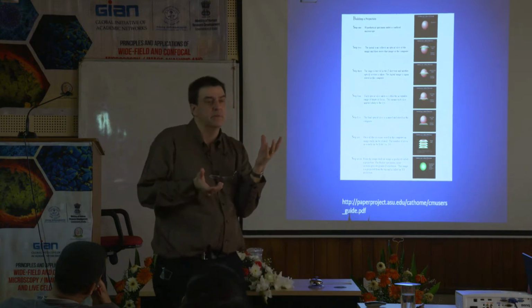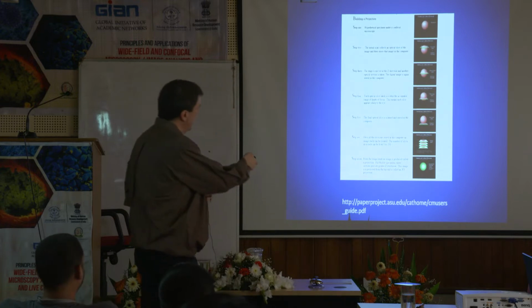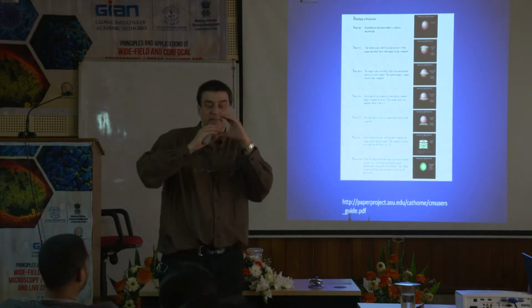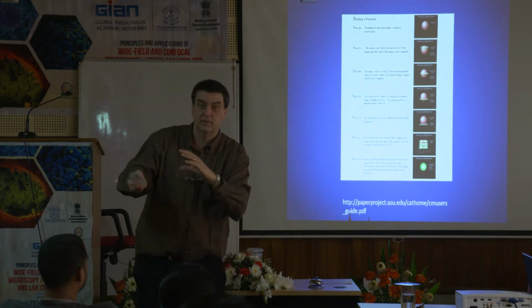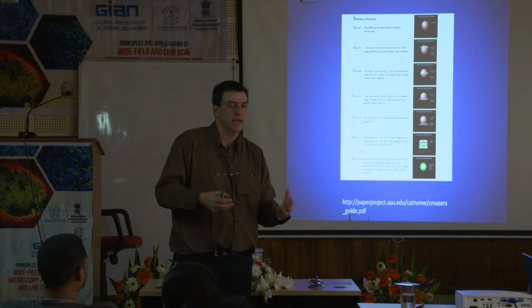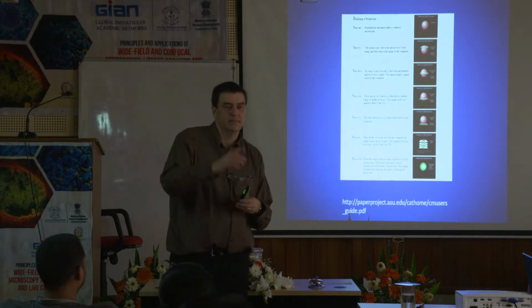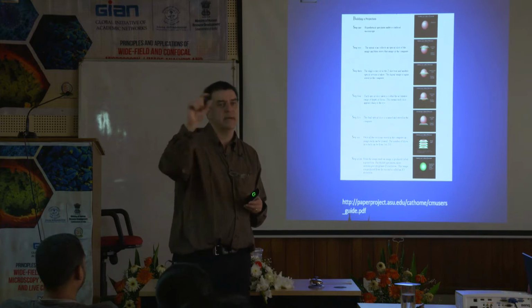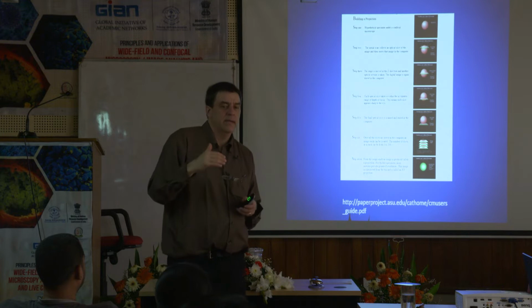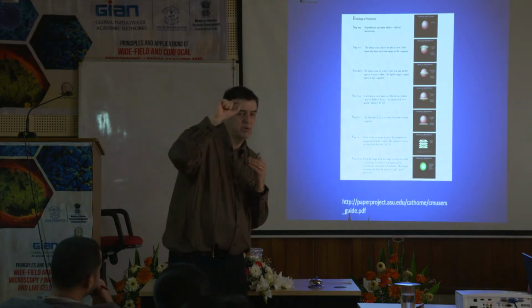And sometimes you'll hear me refer to it as Z step, because remember, I am moving down in Z. So yes, you have to have some overlap, like your question was, but not too much. But the confocals today, the math is done for you behind the scenes. A lot of times you'll see something come up on a screen that says recommended step size, 2 microns or 1 micron.